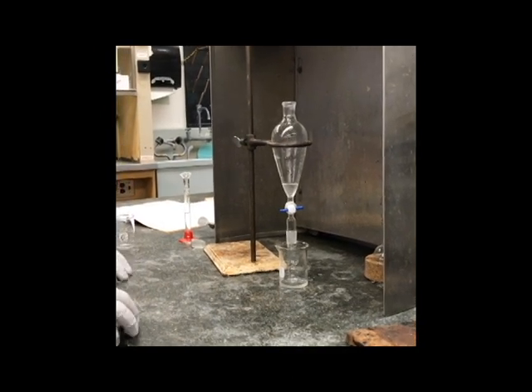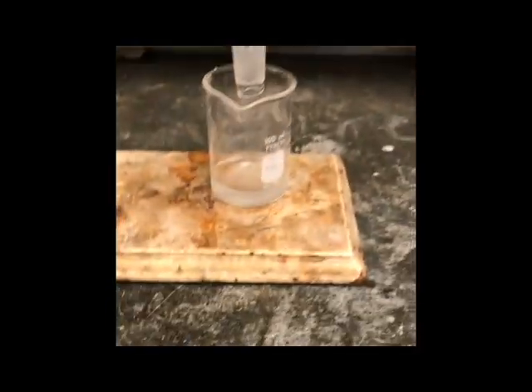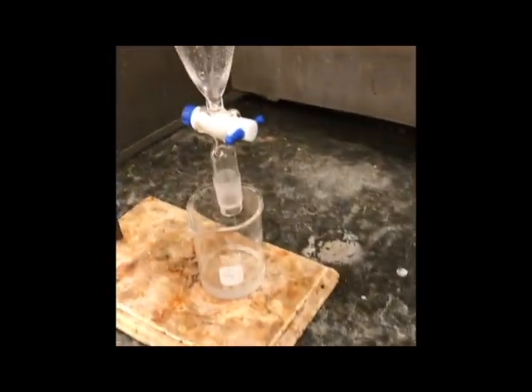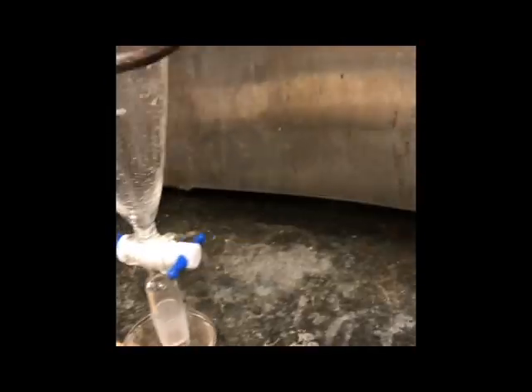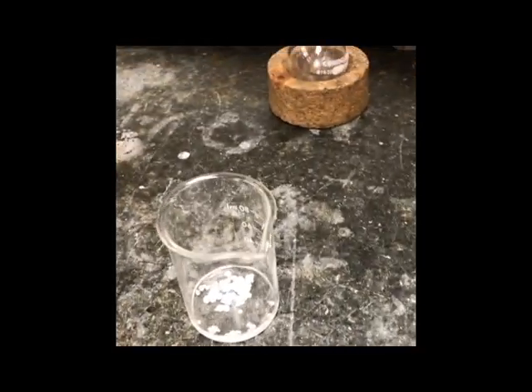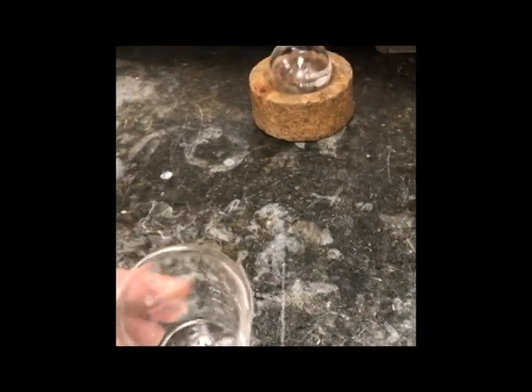Okay, so now the separatory funnel is empty. This beaker contains all of our aqueous washes, so containing your brine or your sodium bicarbonate, anything you used to wash your cyclohexene. We removed what was left of the cyclohexene and put it into this beaker, and what you see in here is the calcium chloride drying agent.